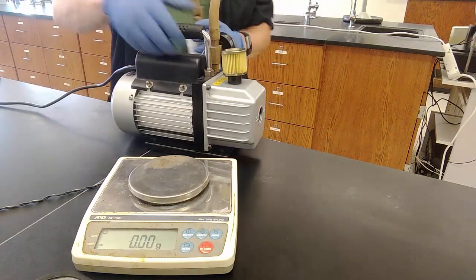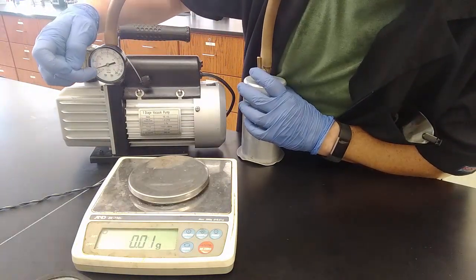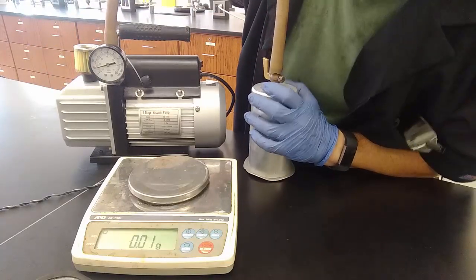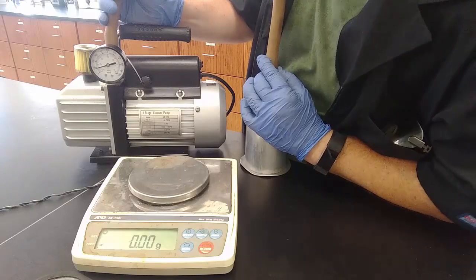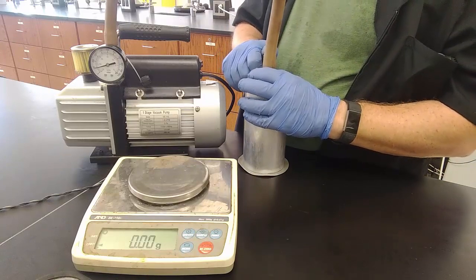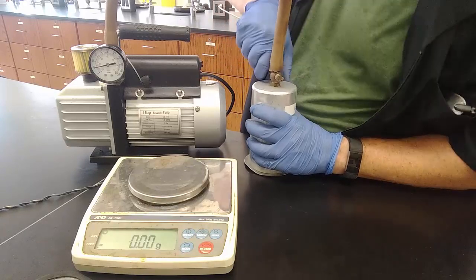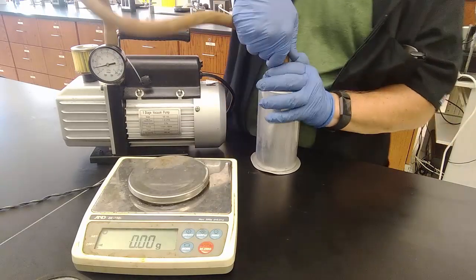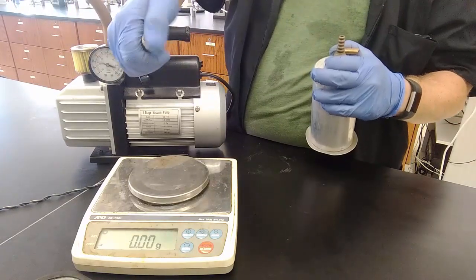As the air gets sucked out of this thing, you'll see this little needle going down, down, down for the amount of pressure in the can. Not really going down much at all, which is not particularly good. Let's see. Twist the knob, if that does anything for us. Nope. Let's take this off and see if it's sucking at all. Maybe just our gauge is no good. Yeah, definitely sucking.